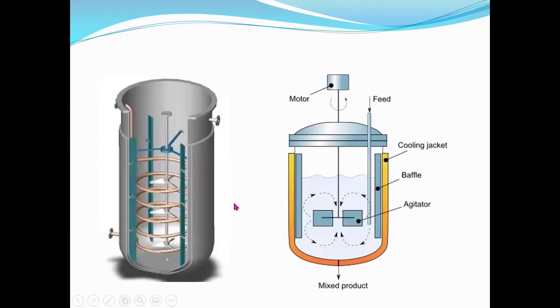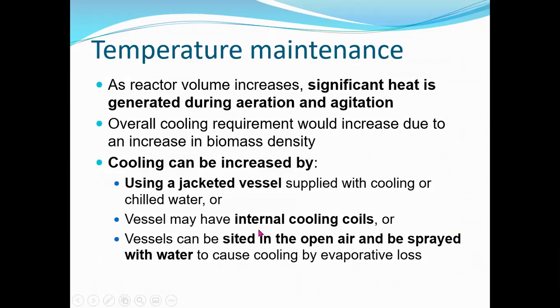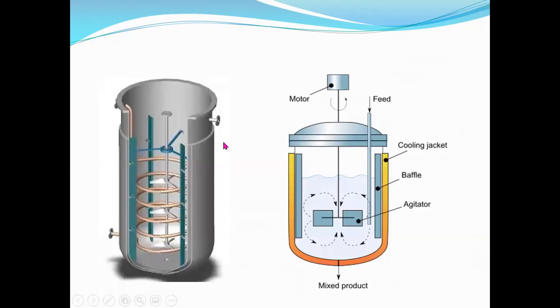Or you can keep the vessel outside in the open air and spray it with water, which will cause the cooling and reduce the temperature.